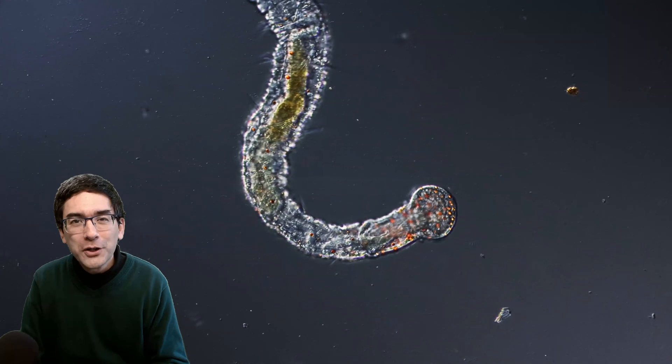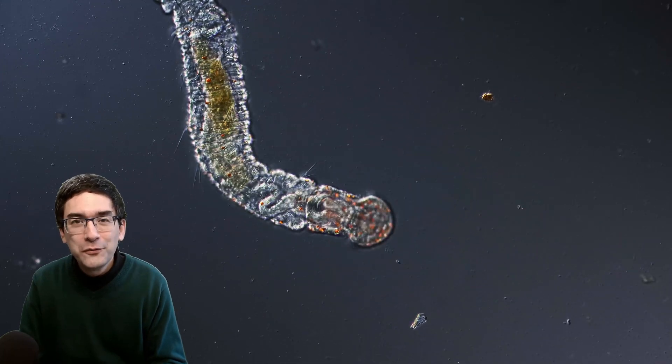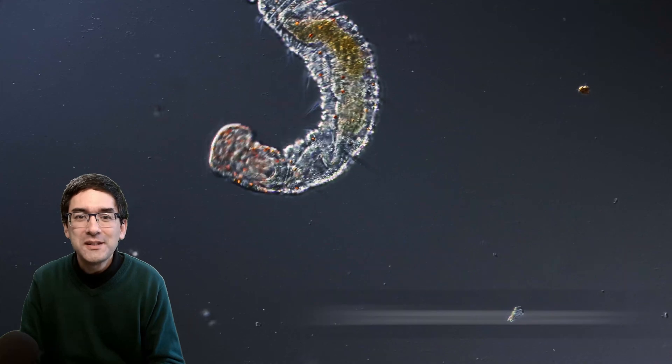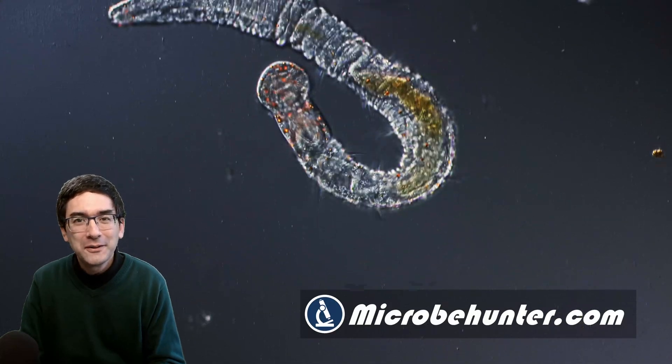It's quite a common freshwater worm, but there are also a few marine species—saltwater species—though most of them can be found in freshwater.